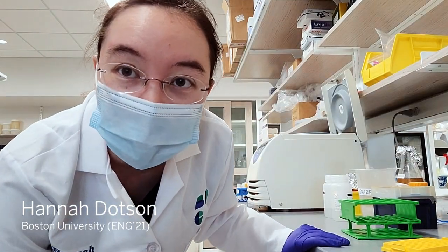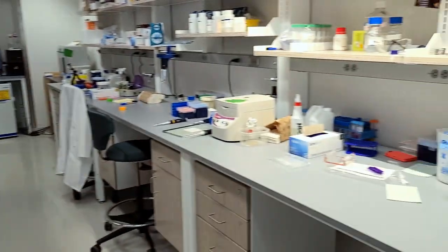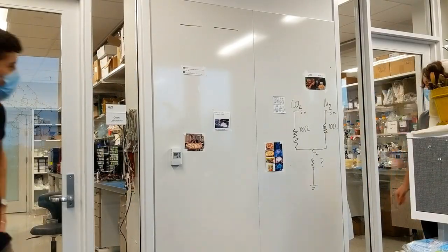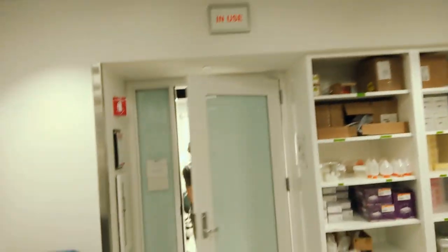All right, so this is the lab space. I guess probably the most significant change is fewer people. There'd usually almost always be someone in our bays before. We've been adopting social distancing in the lab in many of the same ways that we do all around us. When researchers are in the lab, they're staying 6 feet apart, they're wearing masks, all the PPE. When we have enclosed rooms, we only let one person in at a time.